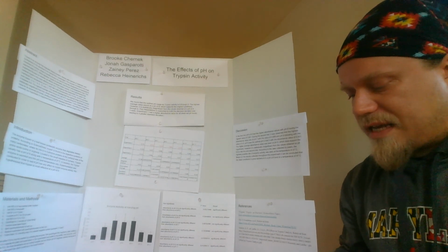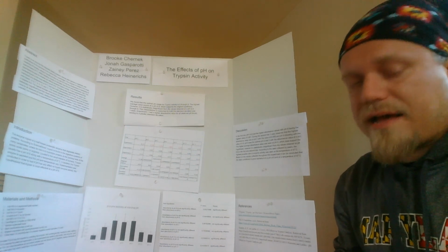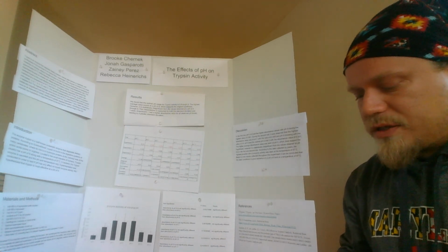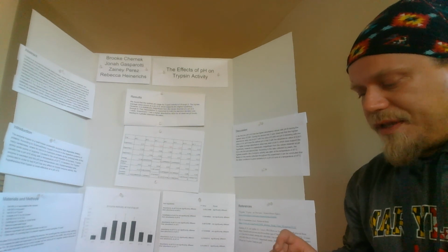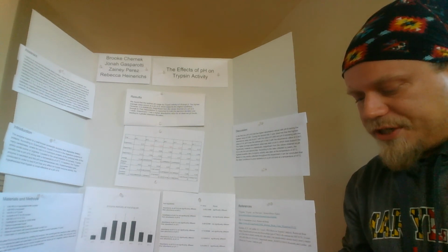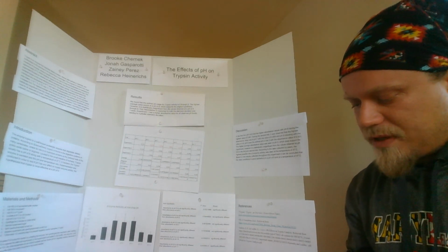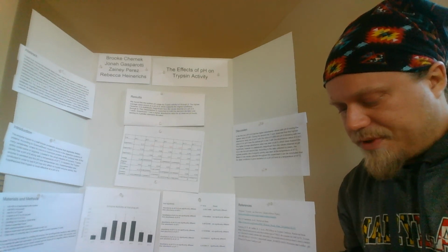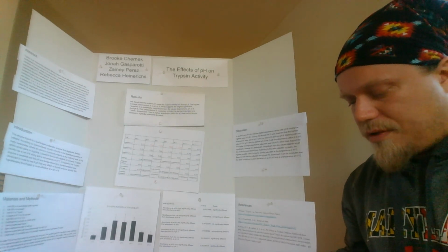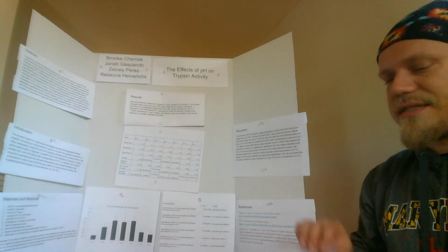This azocasein has had sulfonamide groups added that absorb light at 440 nanometers. So by measuring the absorbance of the supernatant liquid, the concentration of digested protein and thus the activity of trypsin could be determined. Negative control was used to determine spontaneous digestion with no enzyme. 3 trials were performed so they could be averaged and analyzed statistically.